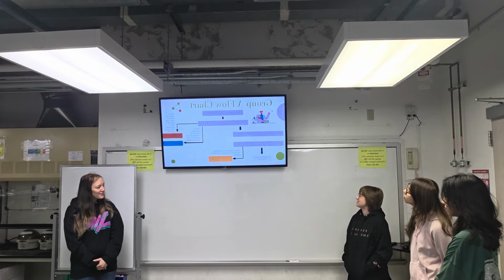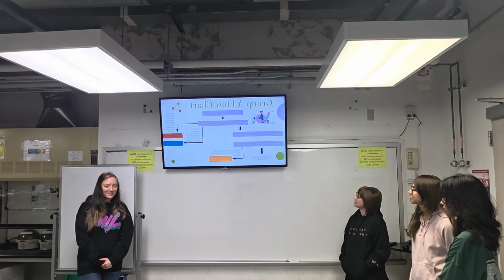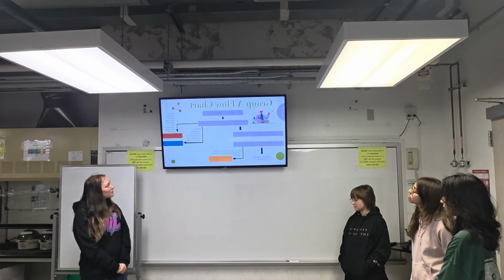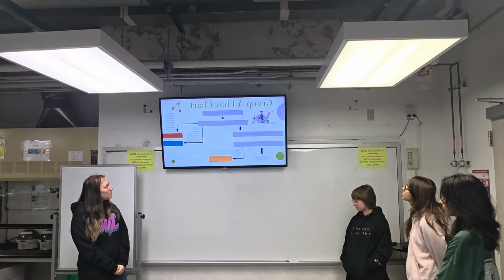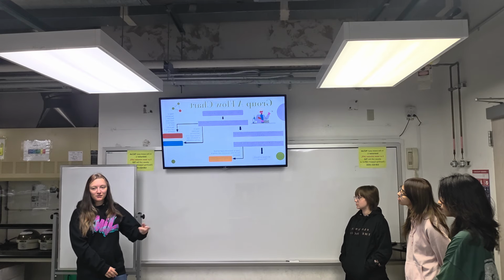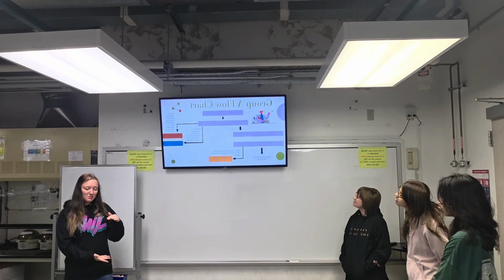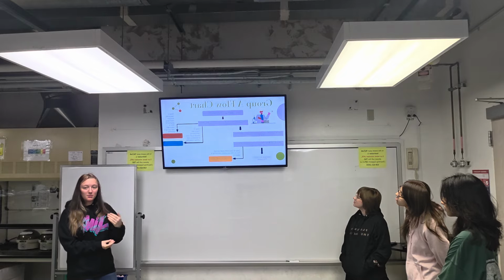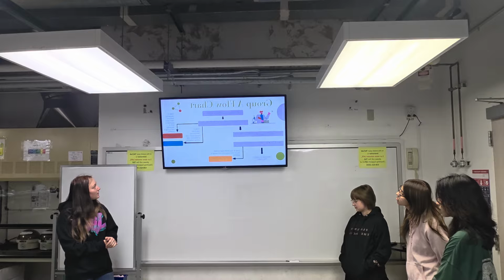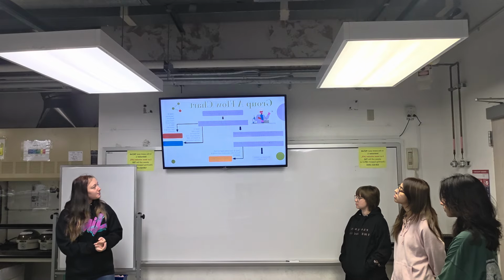So we ended up remaking our flowchart because our original flowchart was not great. I'm going to talk about what we did. So we had our powdered lake pigment mix. The first step we did is we added 1 milliliter of cyclohexane and 1 milliliter of 1M HCl, and we shook it to mix. Then we had our two separate pigments, so our second step was to separate the bottom red lake pigment into a separate vial using just a pipette. And then the third step was separating blue, which was just with a pipette as well.